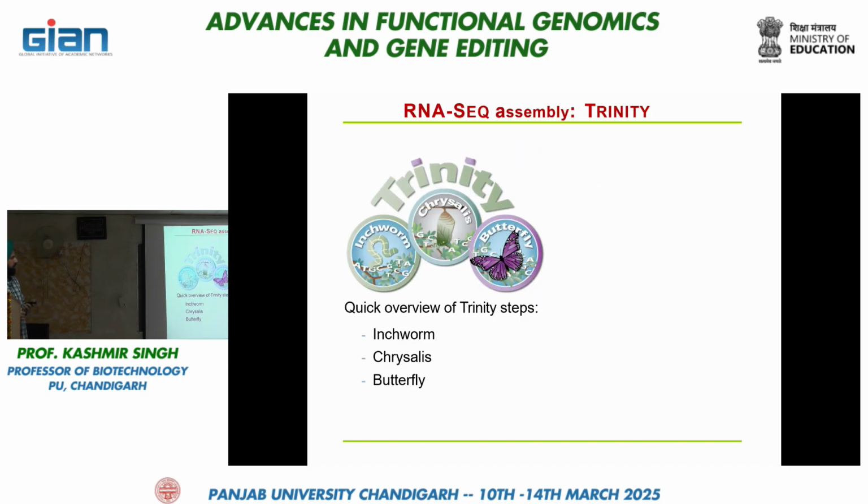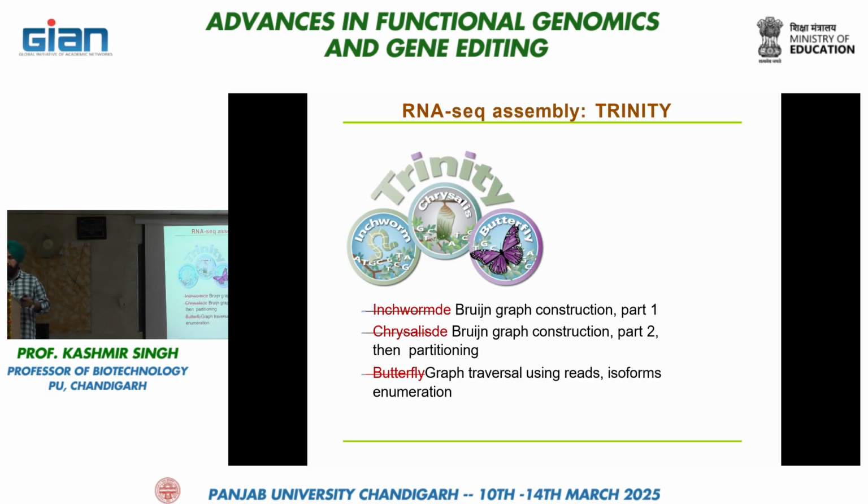Trinity has three programs. Like I said, Trinity is most commonly used because it is free, and mostly people do Illumina sequencing. If you are doing Illumina sequencing, you can use Trinity, which is very simple to use. It has three programs: inchworm, chrysalis, and butterfly, for assembly and splice variant analysis. Inchworm and chrysalis do De Bruijn graph construction, and butterfly tries to find the isoforms or splice variants.